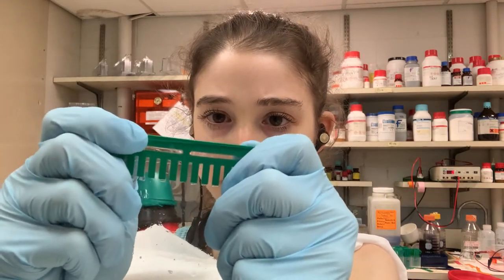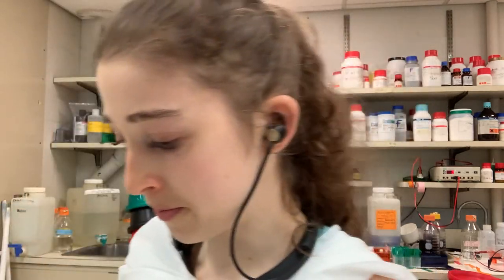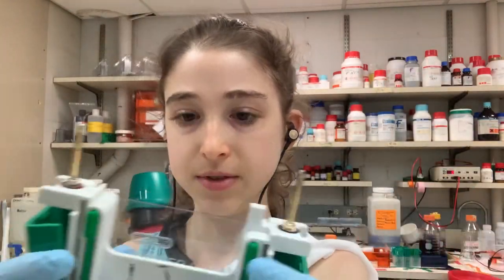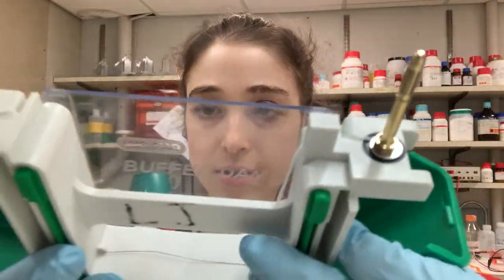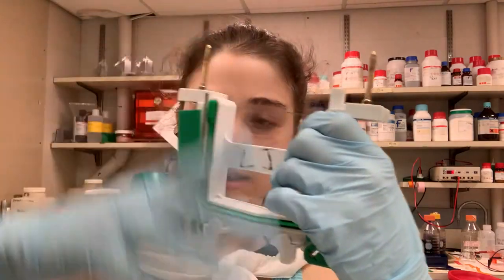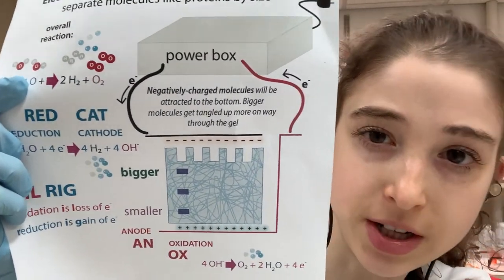You pull the comb out vertically. Some people like to do it while the gel is in liquid, but I have better coordination when it's out. Now you can see the wells where the protein goes. I'm going to stick it in this running gasket — this is a Bio-Rad tetra cell system, so this is the buffer chamber that goes into the unit with the electrodes. That's where the electricity flows — electrons come in, it splits water and stuff, and that's where the bubbles we'll see come from. It's an electrolysis reaction that splits water and generates hydrogen and oxygen gases. Bubbles are a sign that it's working.